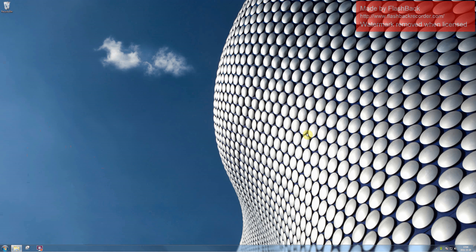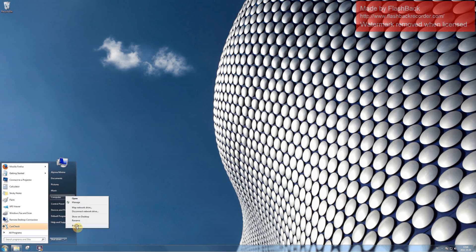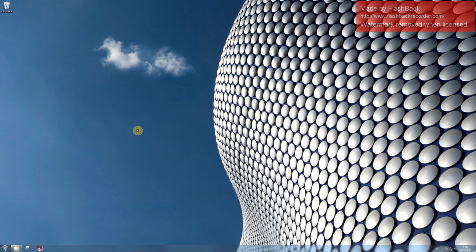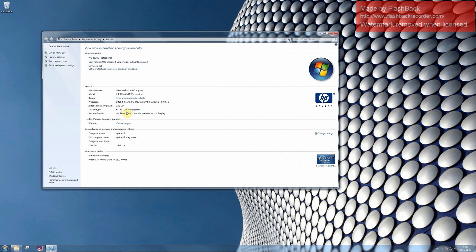Please note that the current version of Zen software we have was designed for Windows 7. You can check your version of Windows if you right-click on the computer and go to Properties. As you can see, this one runs under Windows 7 64-bit.